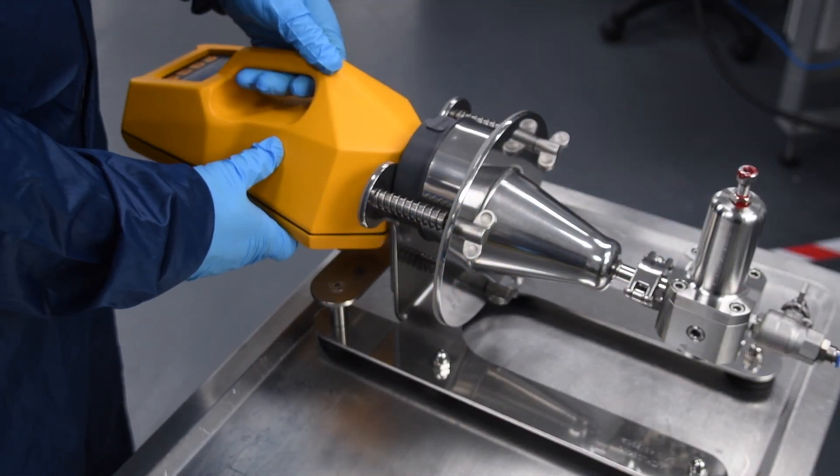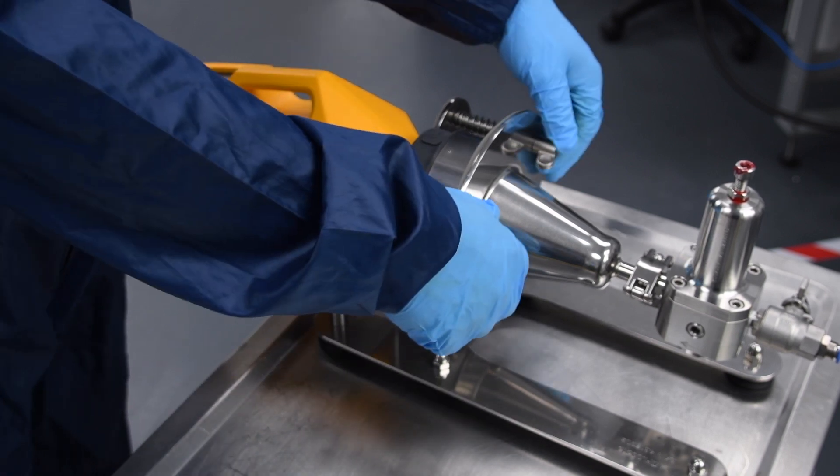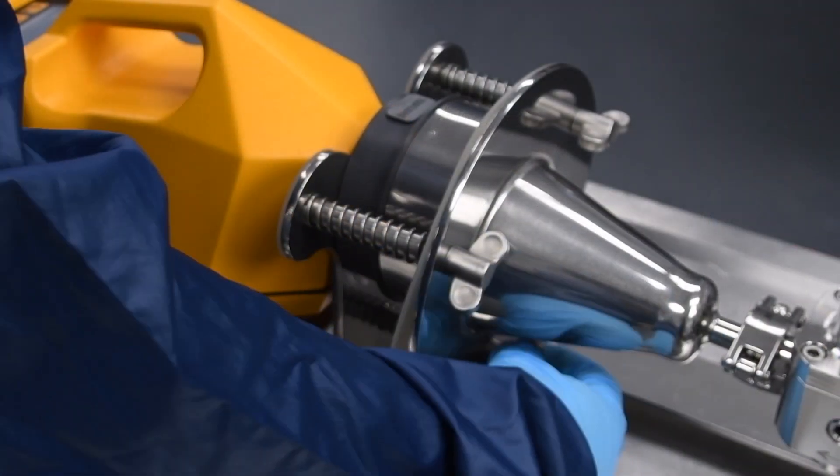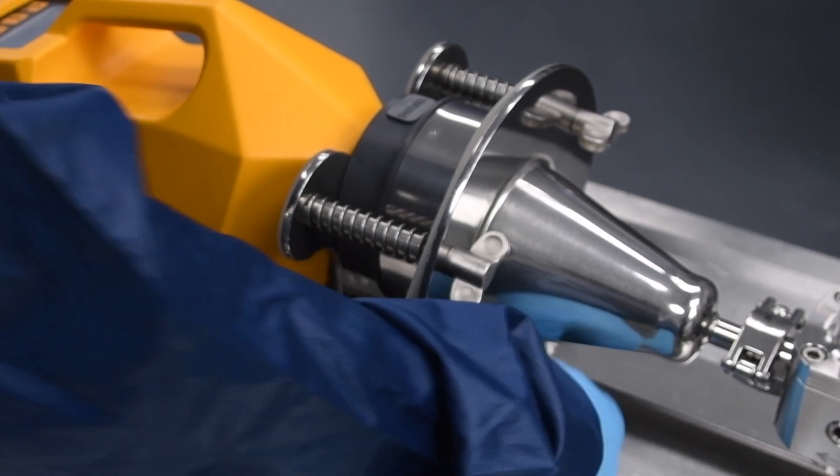Apply the TRIOBOS air sampler to the gas unit by pressing onto the seal and tightening the knobs. Make sure there is good adherence of the instrument head to the seal.